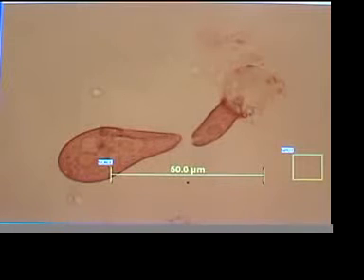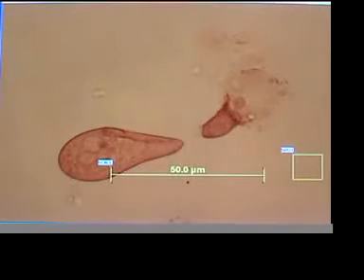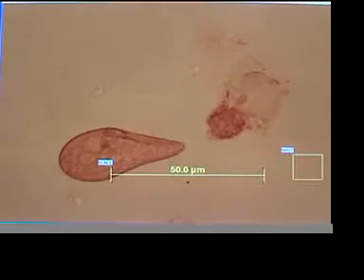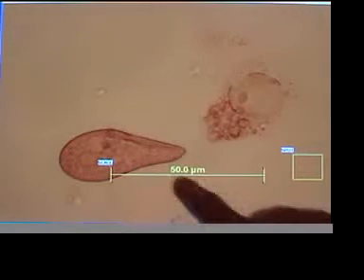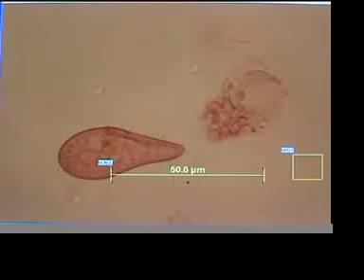10,164 hertz. Notice that the organism next to him is not doing this. This is kind of the mystery of this whole process. Not all organisms are affected. Look at the edges here. They start to take on a granulated shape and then they explode into a series of sphericals like that. But this organism is sitting here and looks completely fine.